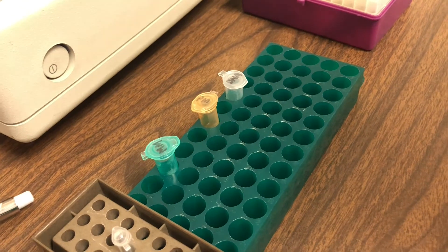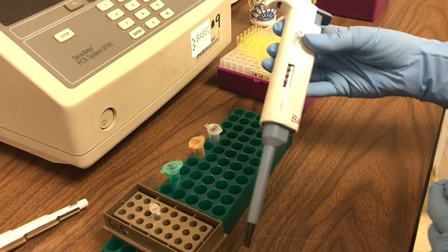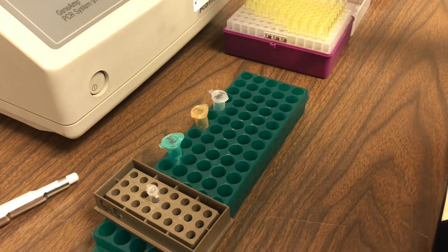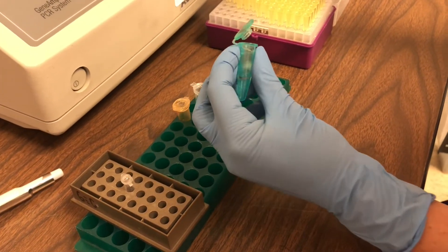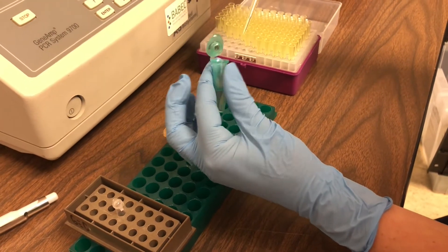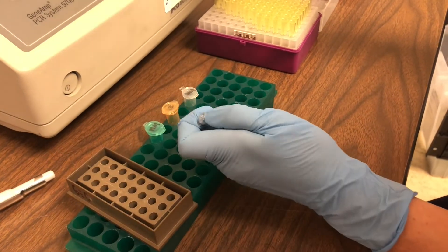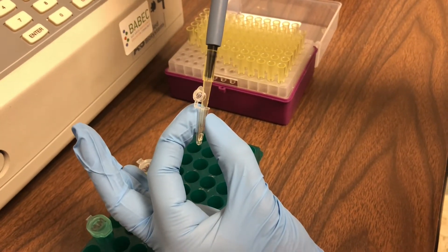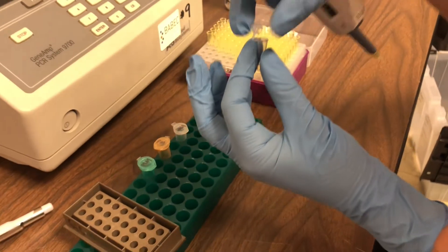Let's set up our PCR reaction. First we're going to set our micropipette to 20 microliters and add something called master mix to our reaction. Master mix has something in it called Taq polymerase — a specific type of enzyme that's going to help us make millions of copies of our target DNA sequence. You'll notice those PCR tubes are much smaller than our regular microtubes.